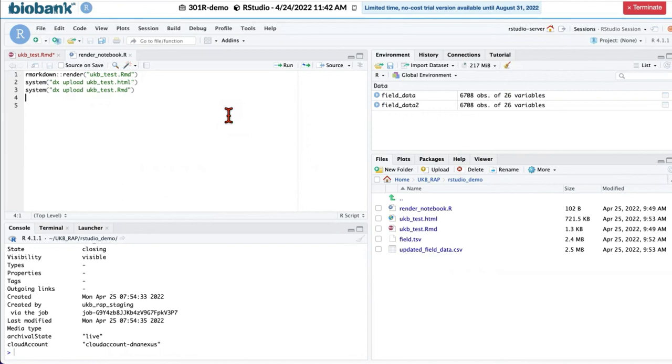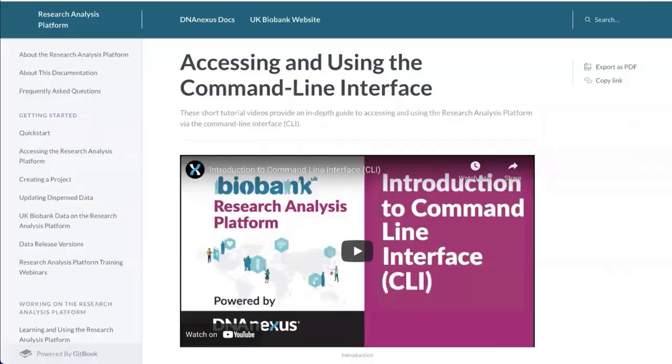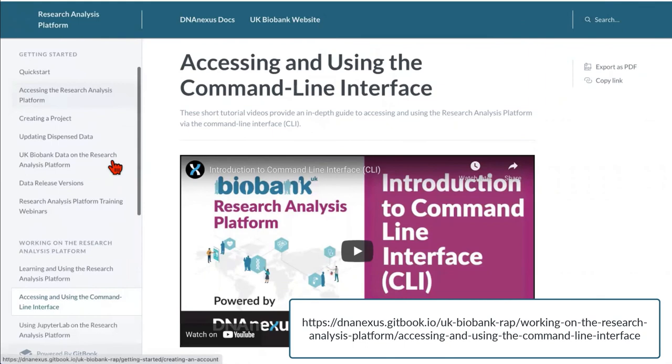If you want to learn more about how to use DX Toolkit in command line, I advise you to look at our documentation at dnanexus.gitbook.io. And here you will find accessing and using the command line interface.